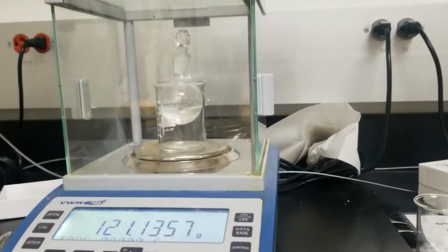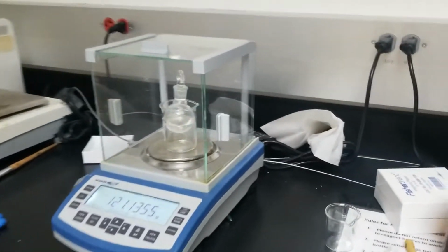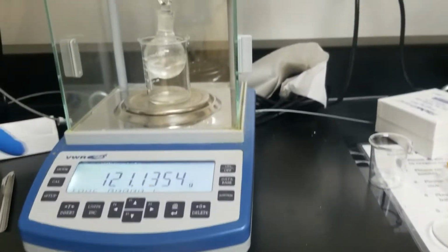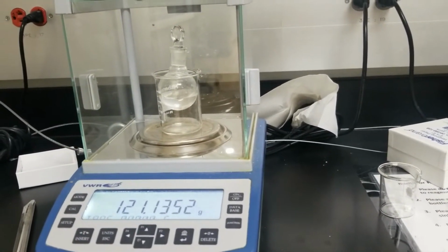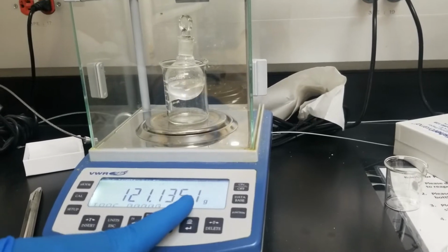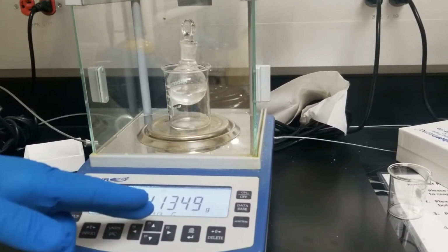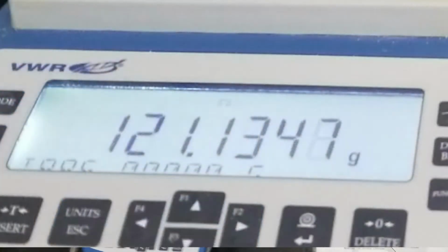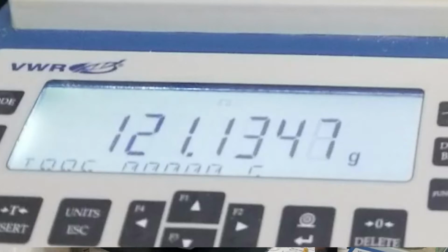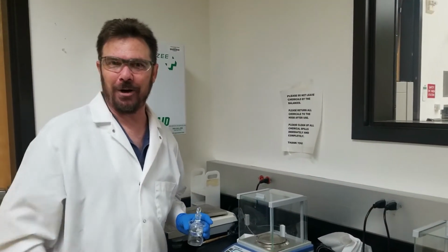Okay. So it didn't go to settled. It's supposed to, the little symbol shows up right here. And again, we're talking about a tenth of a milligram out here. Okay, let's stop right there. 0.1347 for your final one. If you missed it, you can go back and rewind and see it again.